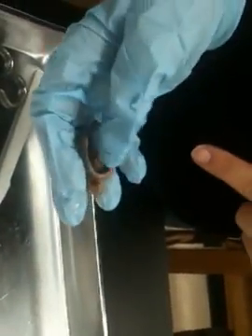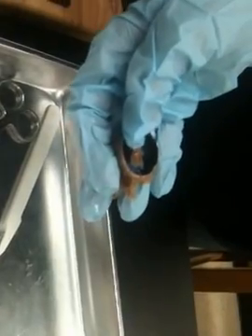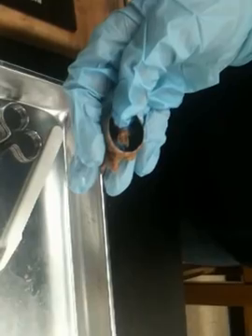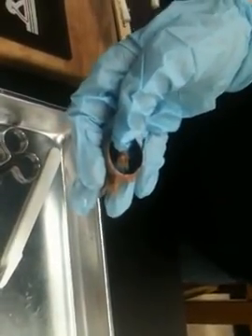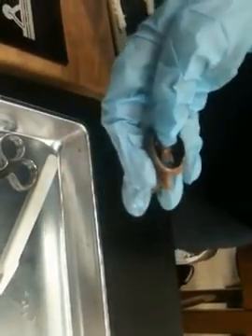And I can grab one of the other eyes and show you one that's still intact. But see how it's all kind of being held in place? Mm-hmm. So it's all coming together in one spot, and the spot where it all comes together is where the optic nerve exits the eye. So that's the blind spot, or the optic disc, right? And so there aren't any photoreceptors there, which is why it's a blind spot.